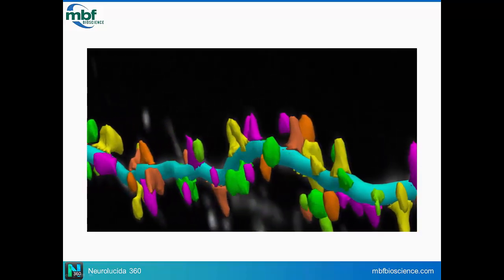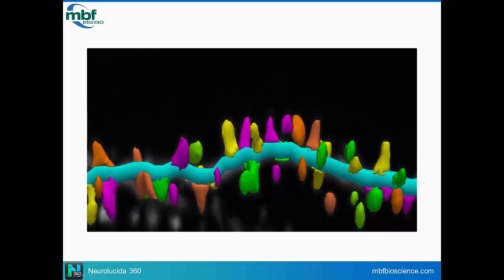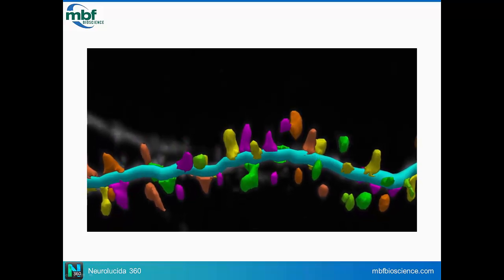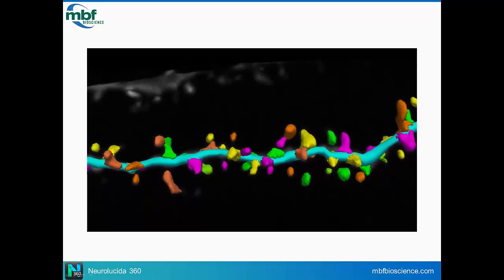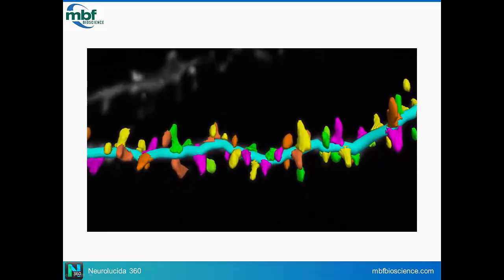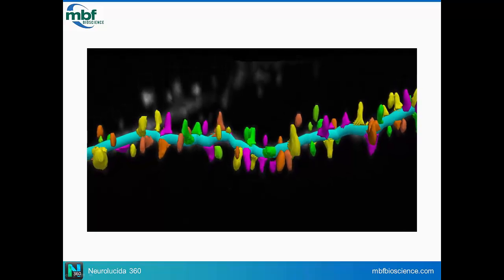I think that also shows that you've got a stellar technique and you're very proficient at your job, that you can so cleanly label your neurons and fill them to just the right amount, not too much, not too little, just right, and that it can retain that label for that long. I think that's really cool.